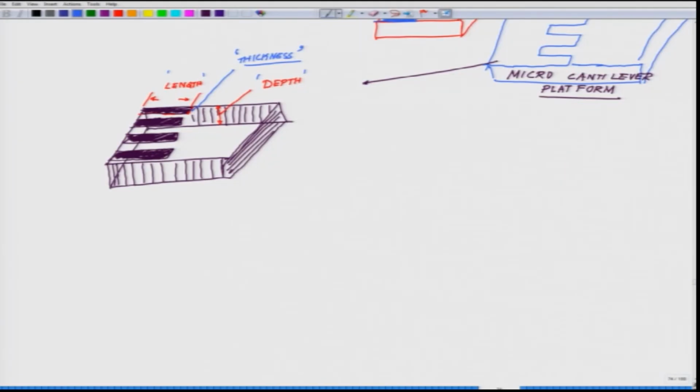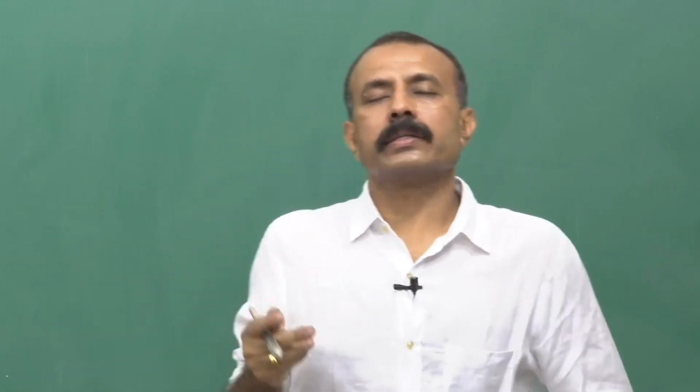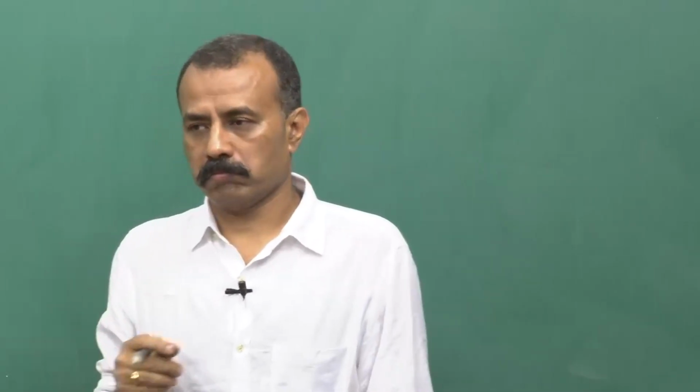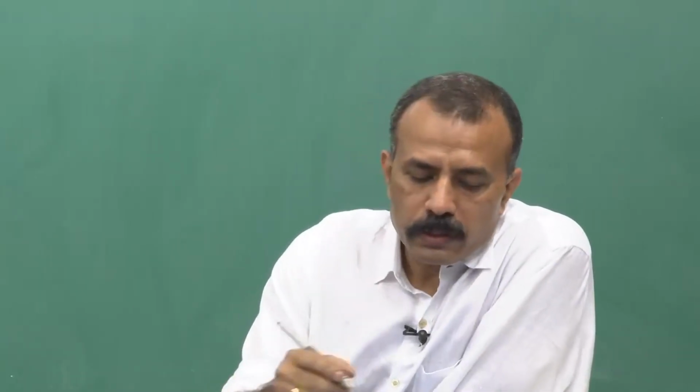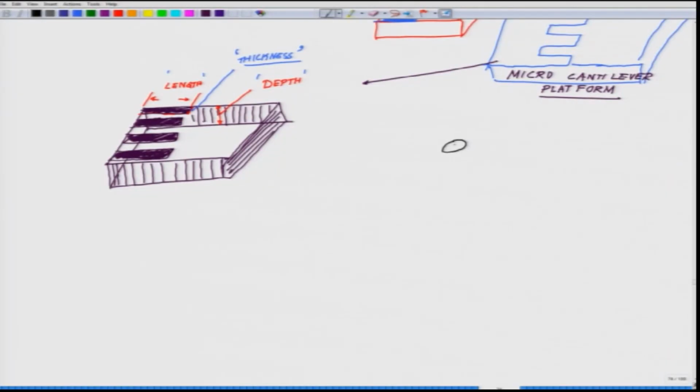Now, say we have a case study: we wanted to measure the force generated by skeletal muscle. So, let us visit the skeletal muscle biology as a backup. You have these muscle cells in a culture, and they divide, and post division they align like this, and post alignment they merge like this.